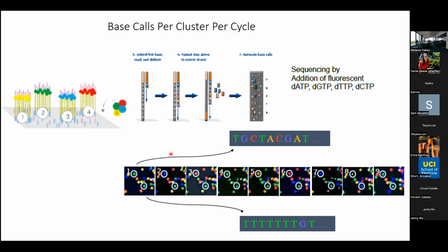And as long as they can align those ends, then it's like, okay, I'm going to call this beta-actin or whatever. Some people say you need more than 35 bases because you could potentially get alignment at other places along the genome or the transcriptome, and so larger amounts of sequence on either end give you more confidence.